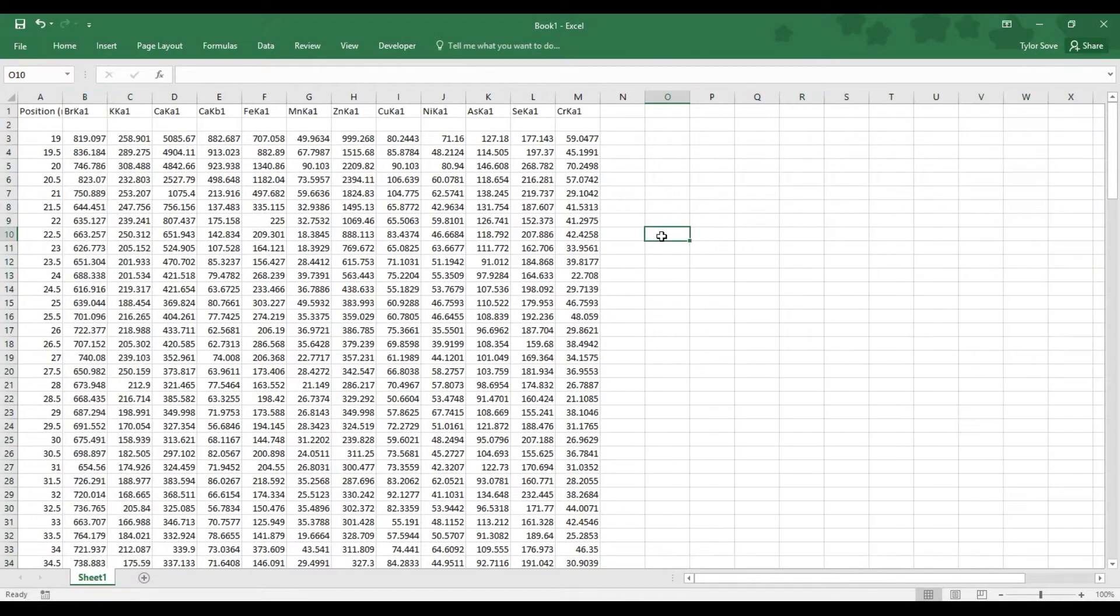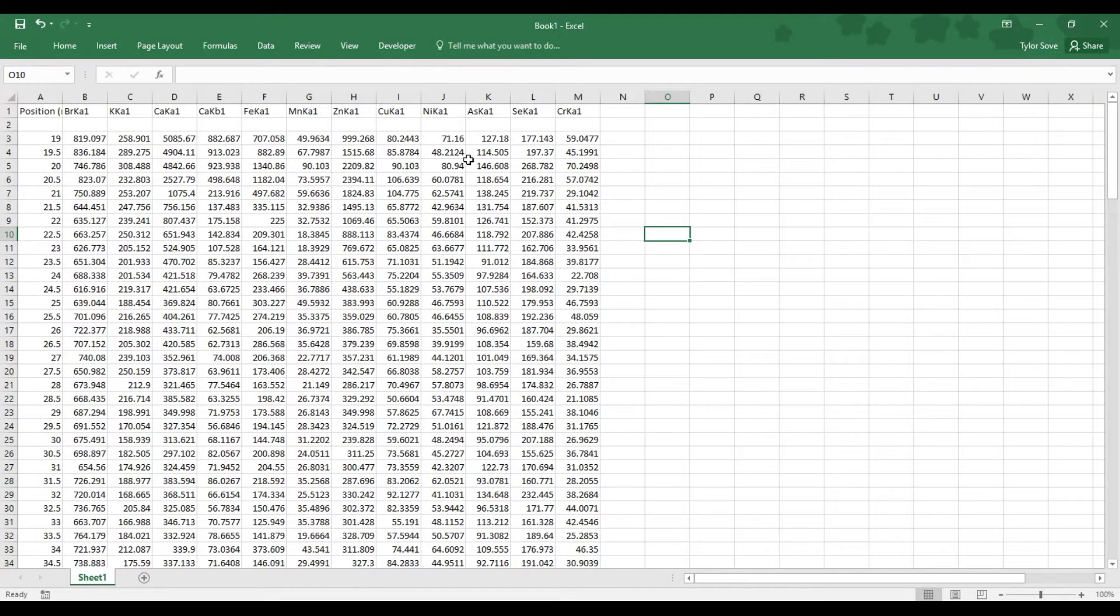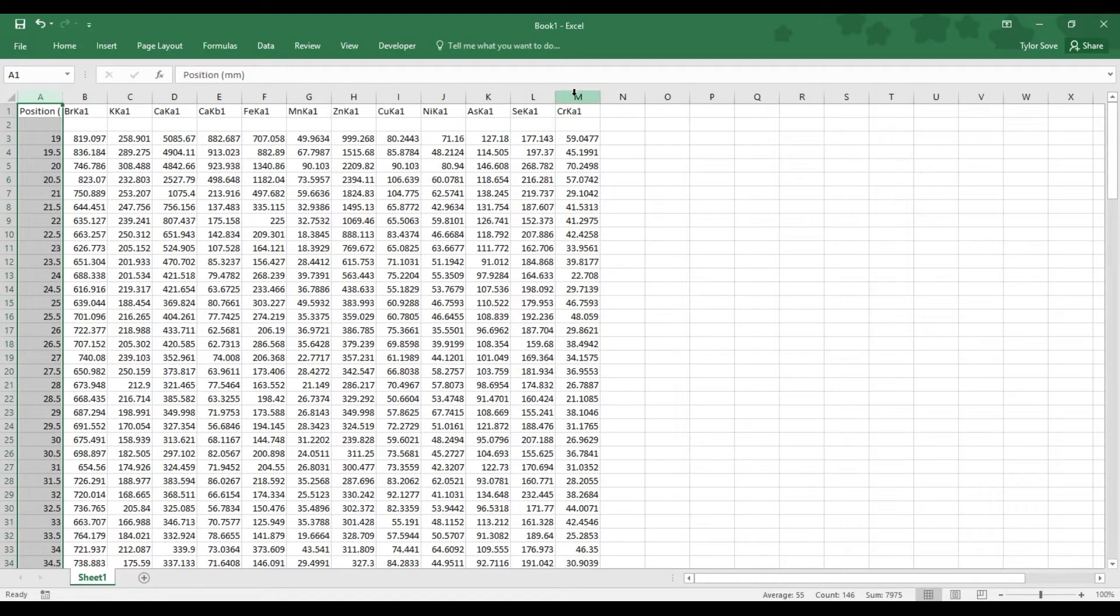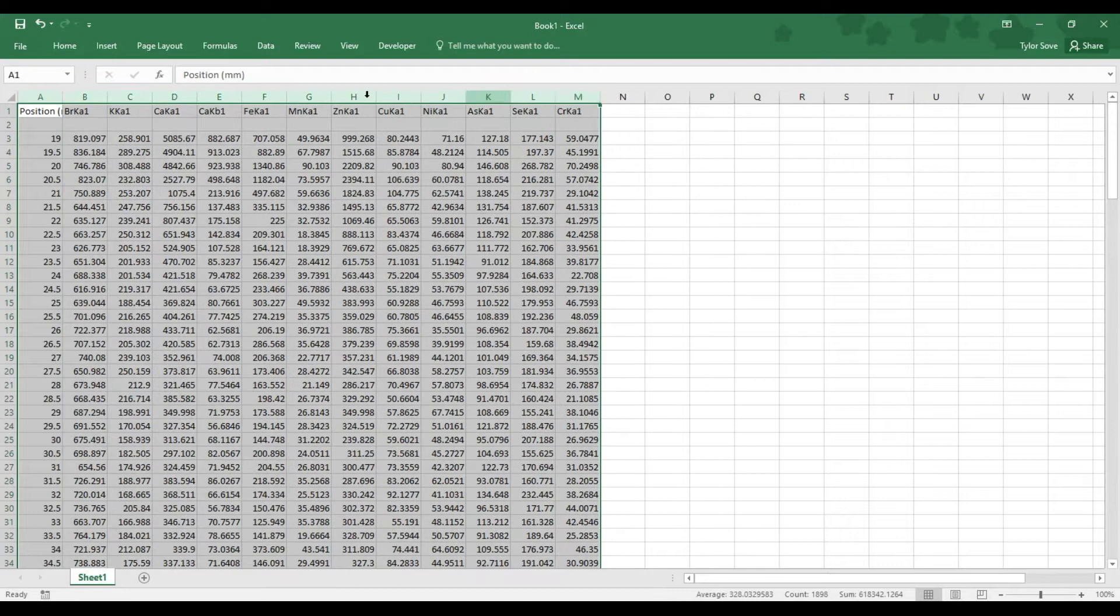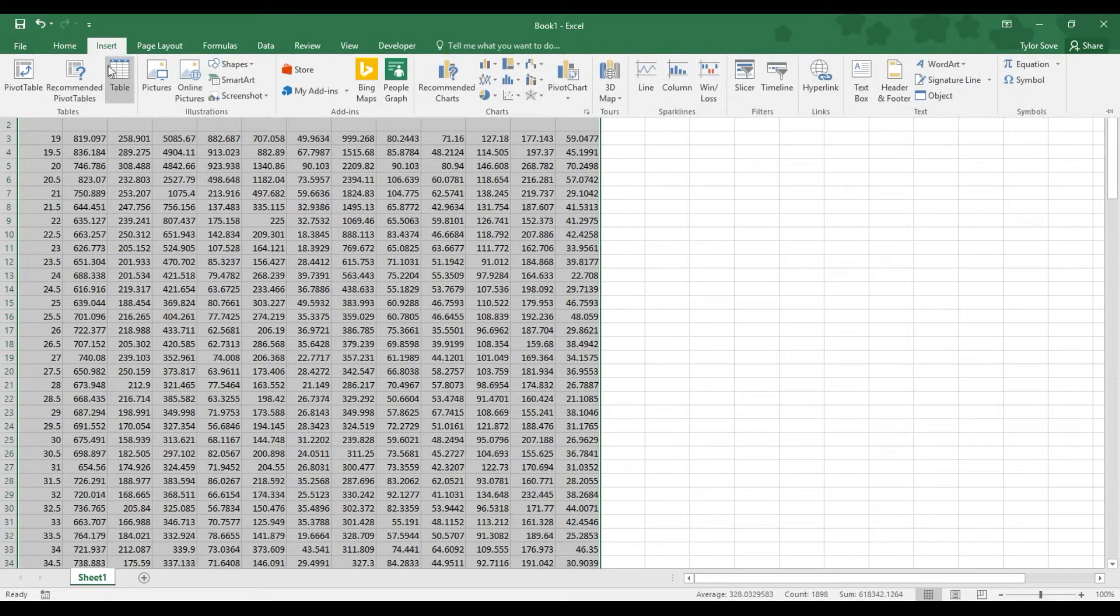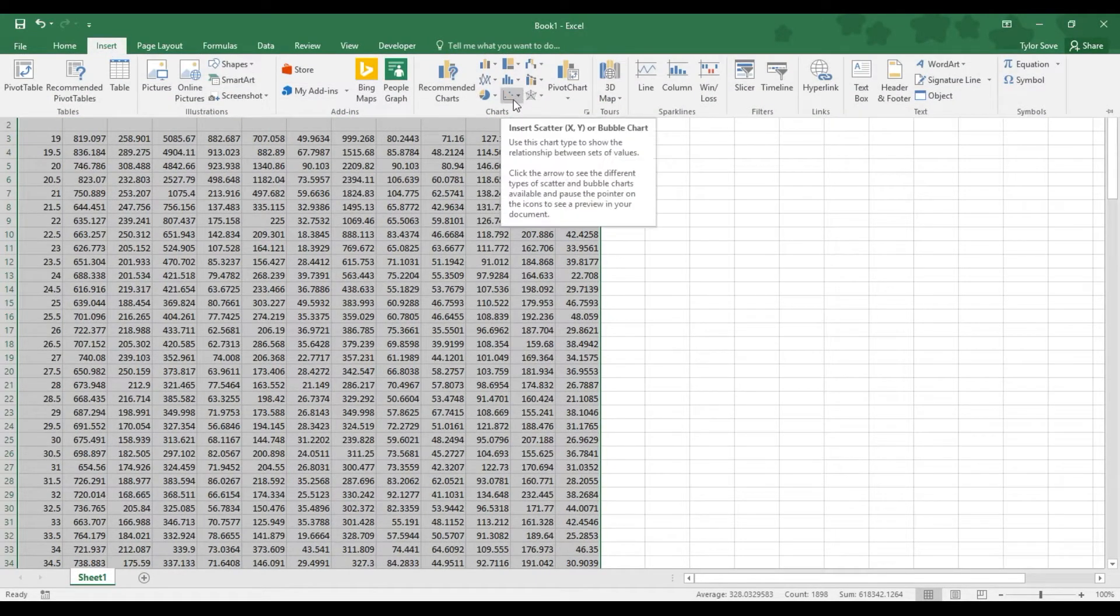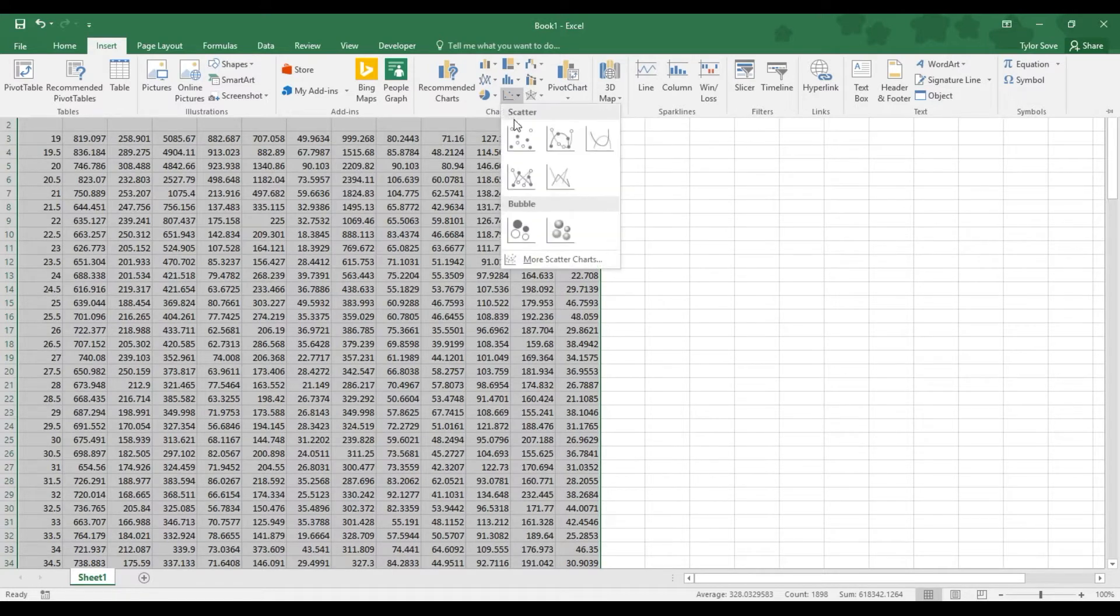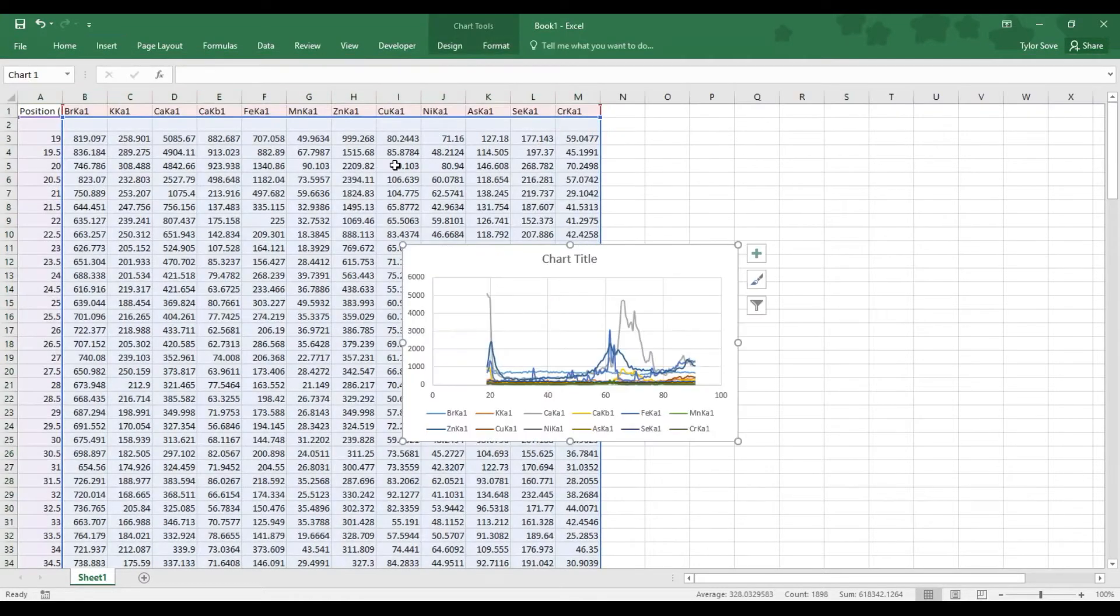What remains is now the data we are interested in, and it's now a matter of plotting it. So, to plot it, select Column Header A, hold Shift as you select Column Header M, go up to Excel's Insert tab, go to the right into the Chart section, and the Insert Scatter or Bubble Chart drop-down menu, select that, and select the Scatter with Smooth Lines option.